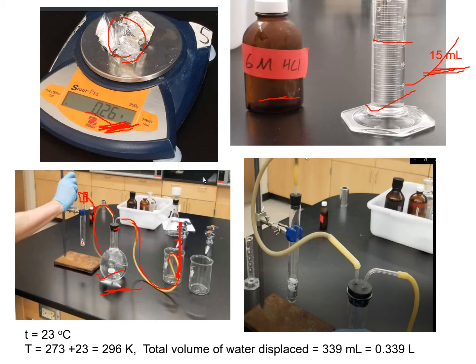You should not allow any gas to escape. So you should close as soon as you put HCl into it. You must immediately close the top of this test tube so that the hydrogen gas is not lost outside. So that hydrogen gas will come through this pipe and will be collected in this round bottom flask. This hydrogen gas will give the pressure, and due to that pressure the water gets displaced. The water gets displaced from here, and it goes like this and gets collected in the beaker here. So the water is being displaced by the hydrogen gas and is being collected here.